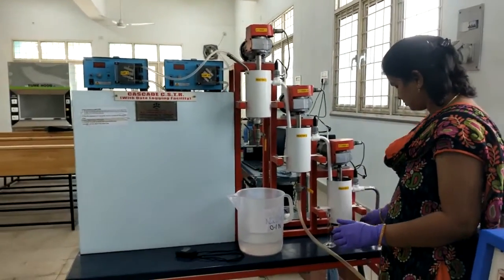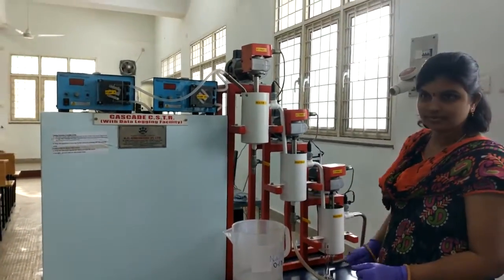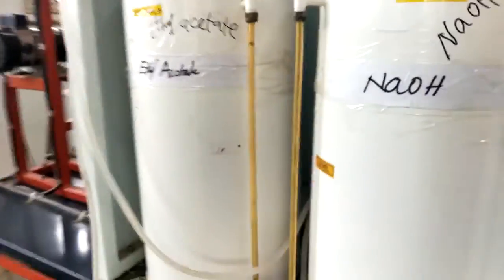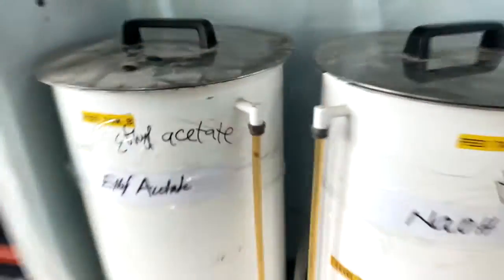After emptying the tanks, we will close the valves at the bottom. We have to ensure that the collection tank has sufficient NaOH. If not, we have to refill the tank. For 3 readings we need to ensure that.